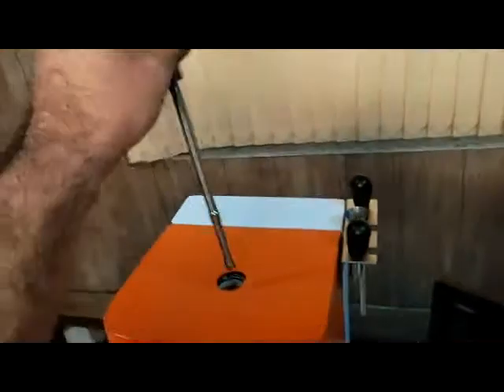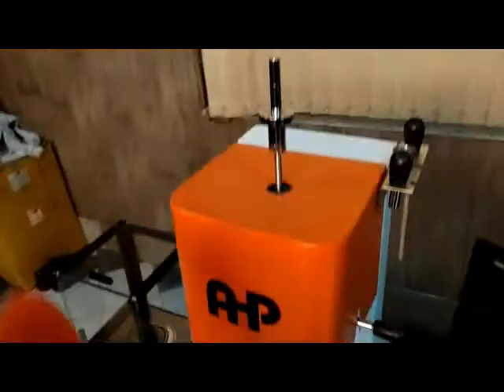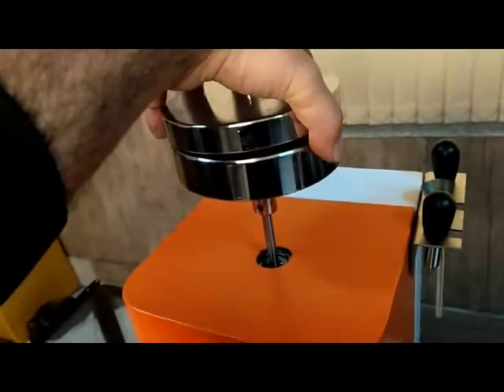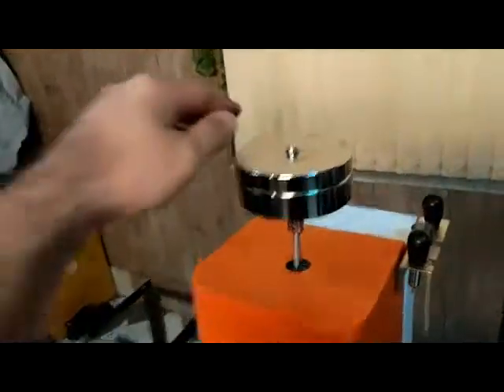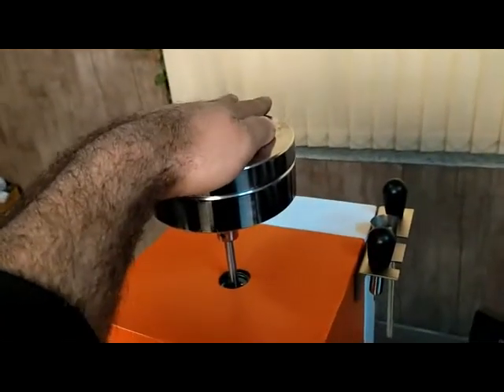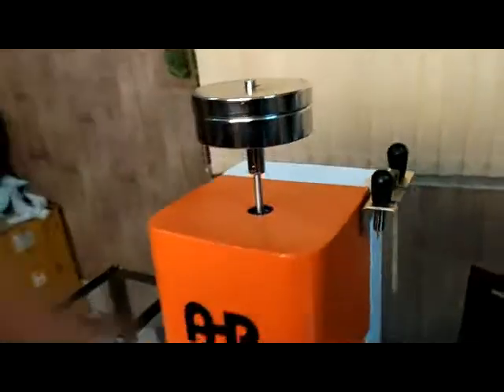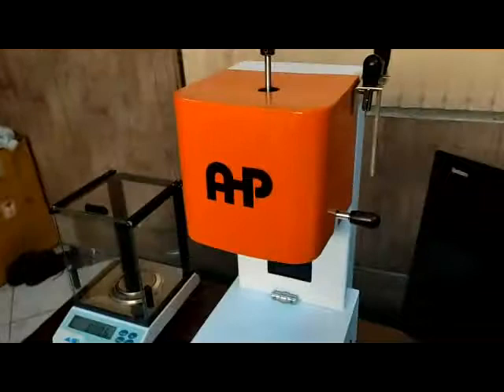Then you must put the piston on and add the weight, and push them a little for the excess material to be out of the die.